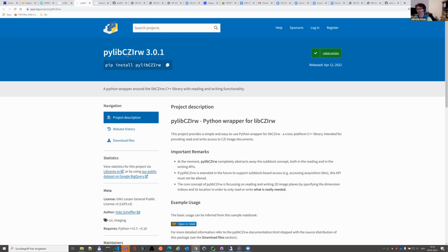And based upon that specification, Bioformats developed already years ago, also with some support from us, a component called CZI Reader internally. But as all of you know, Bioformats is based on Java, and this is really useful, and it's still used all over the place. But internally at Zeiss, we do have some projects where we also need other ways to read a CZI. And I think 3 or 4 years ago, we first published on GitHub a C++ library called libczi.